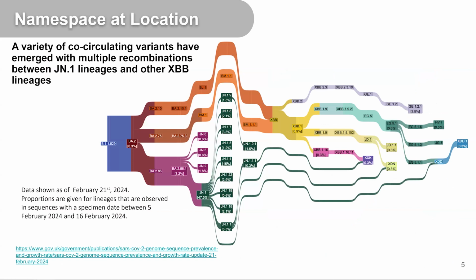Okay, so pangolin lineage, where this is an example from UKHSA, where they're paying attention to the distribution of pangolin lineages at a particular point in time.